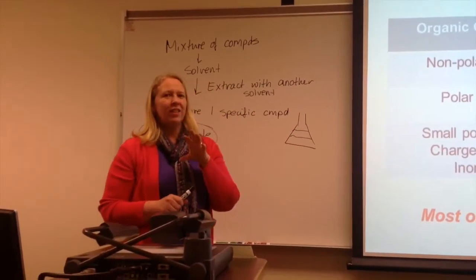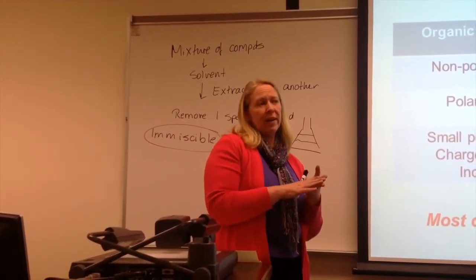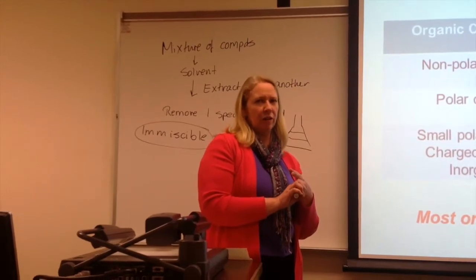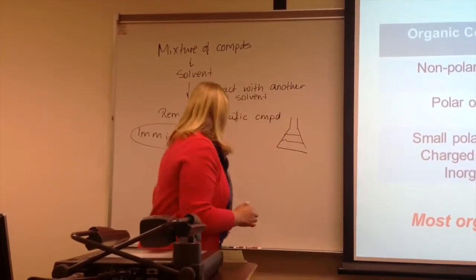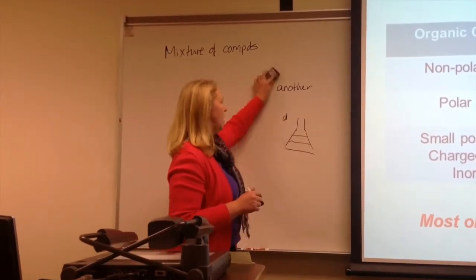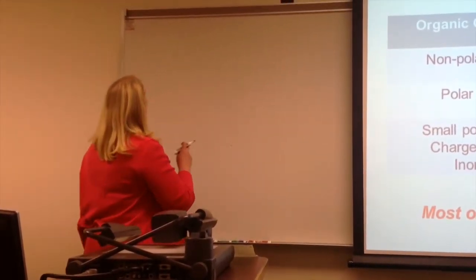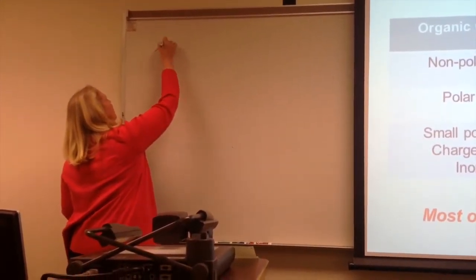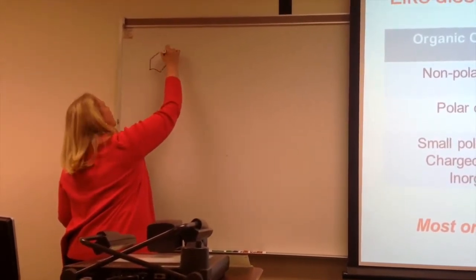So you are going to be looking at a mixture of a carboxylic acid, a neutral compound, and an amine compound, and we're going to manipulate those to separate all three of them. So we'll talk about the first two components in your mixture first. One of them is going to be orthotoluic acid.